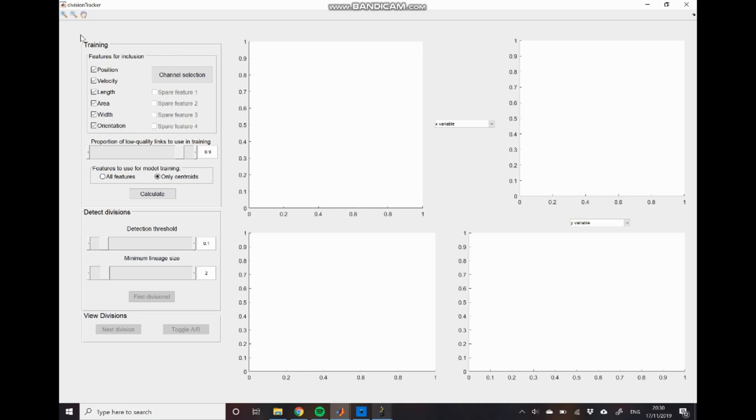The second difference is that we pool all division events into a single data set rather than separating by time. Although this sounds like it should take quite a long time to perform validation on, because division events are much sparser than the original tracking data, you can actually perform tracking over a relatively short period of time.